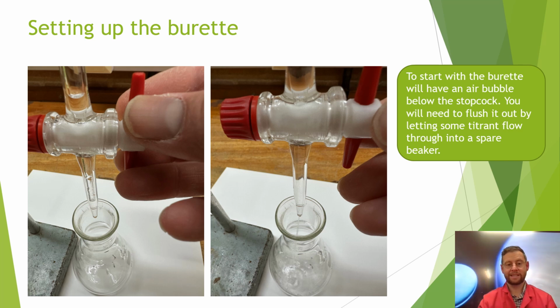So what you can see here on the left is that there's an air bubble underneath. I've not flushed the burette. I need to let that air bubble get pushed out by some of the liquid. Otherwise, the first few drops in the volume that I detect at the top are actually not going to have added to the analyte. It's just going to be pushing the air out. So we need to push the air out first, stop the stopcock, and then replace the flask underneath with our analyte so that we're ready to go.